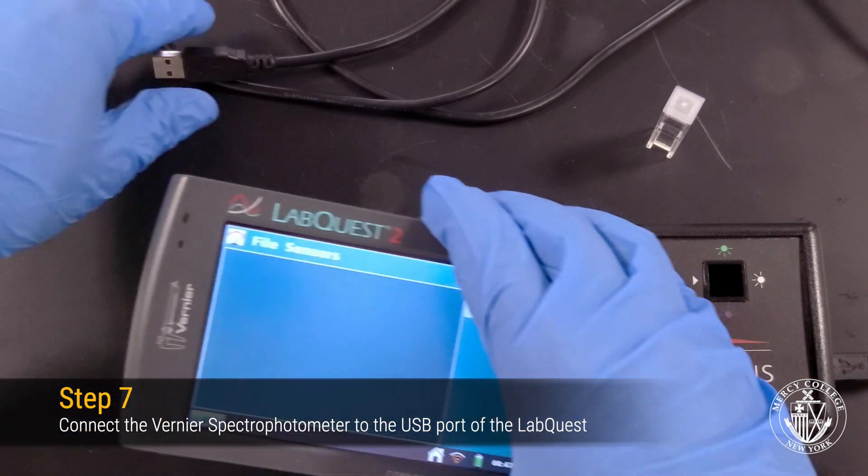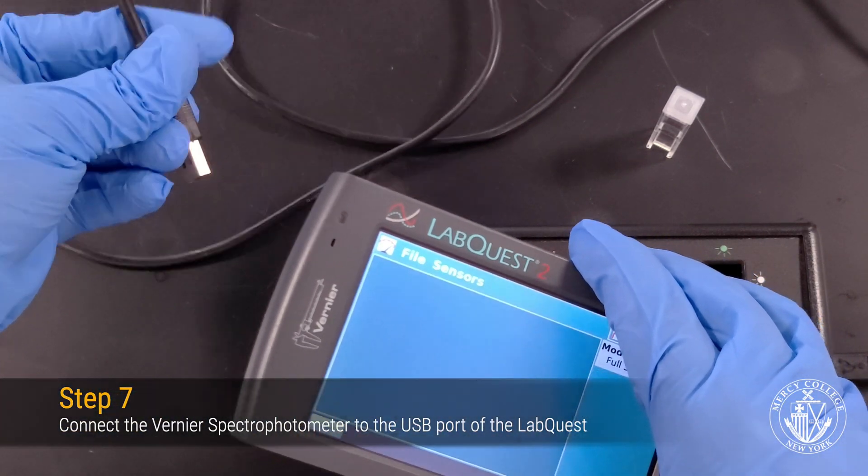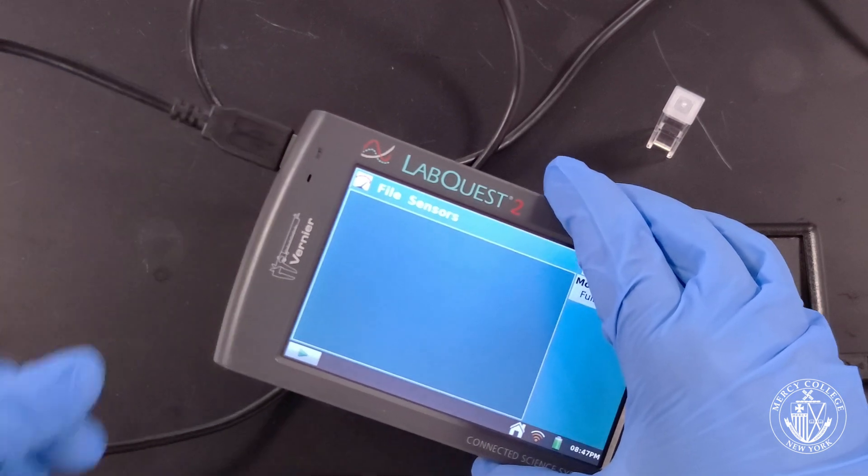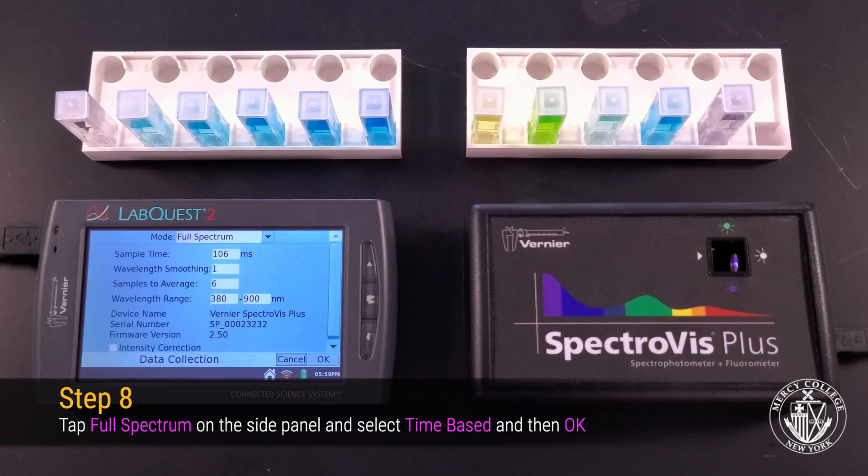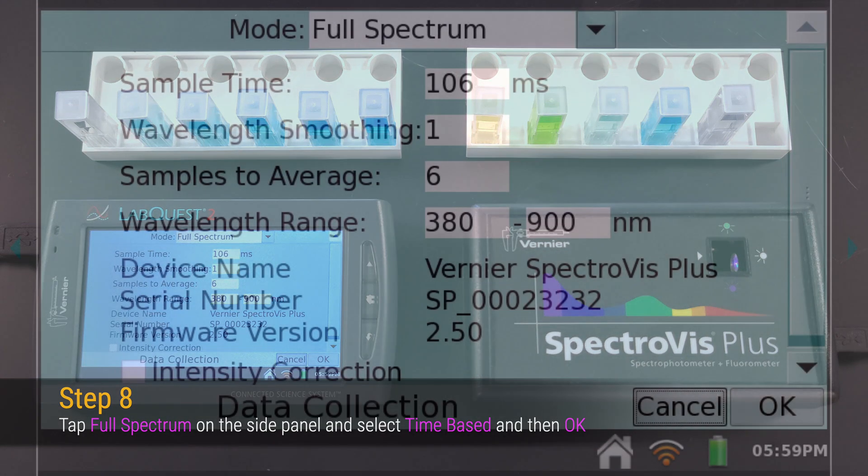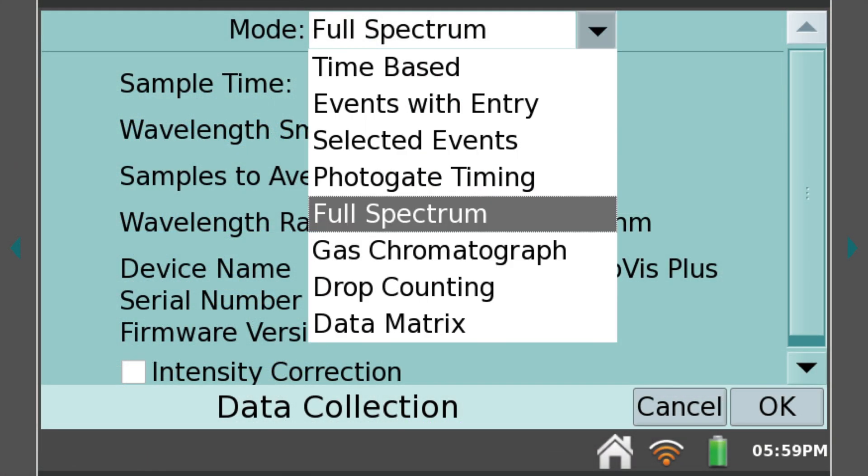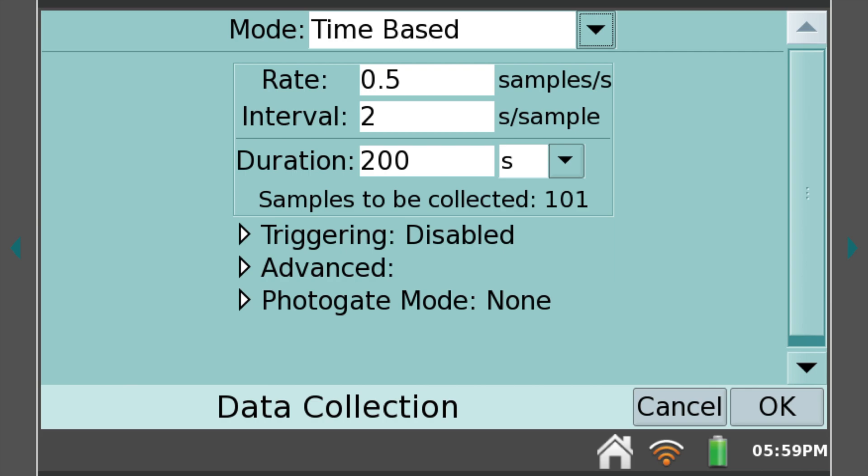To analyze your samples, you need to make sure that your spectrophotometer is connected to your LabQuest via the USB cable. On the side panel, tap Full Spectrum, and then select Time Based from the drop-down menu, and then click OK. This will give you access to the live absorbance readout.